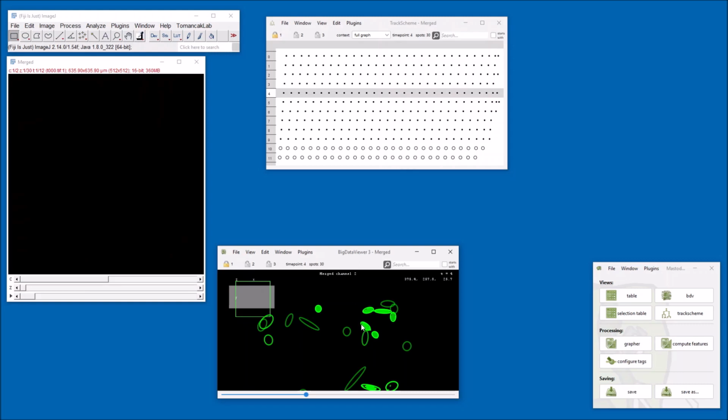And this segmentation data is actually processed pixel by pixel, and all of these segmentations have one common pixel value, and from the distribution of these pixel values, you can compute a variance-covariance matrix, and from this variance-covariance matrix, you can derive the ellipsoid parameters, so the three axes and the center of the ellipsoid.